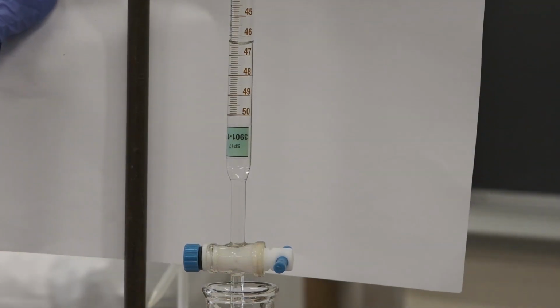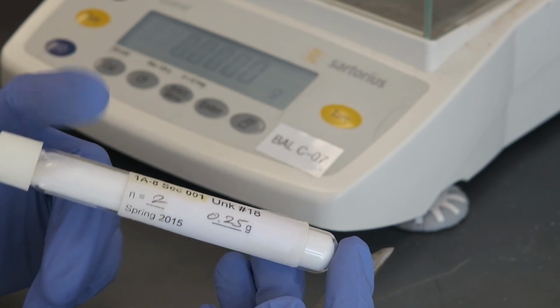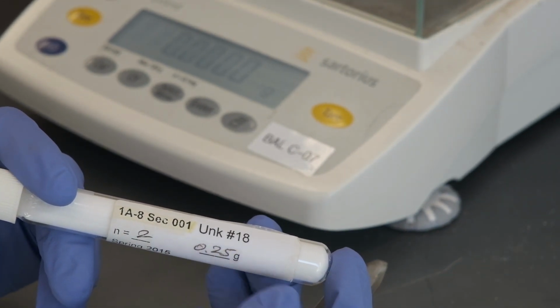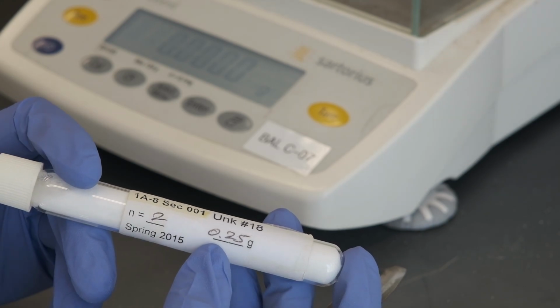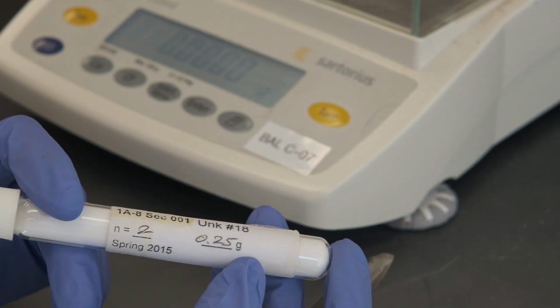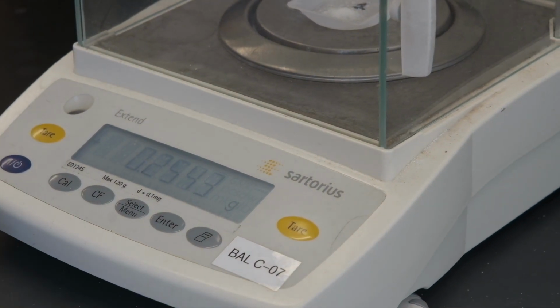Just hold it. Yeah. This is the unknown solid acid, unknown number 18, n is equal to 2, and each sample should contain around 0.25 grams. And then record to the appropriate number of significant figures.